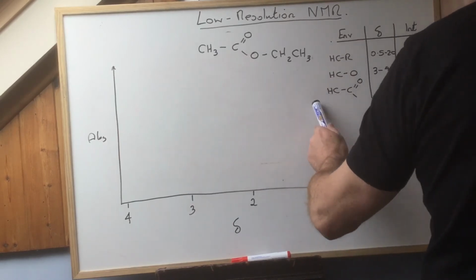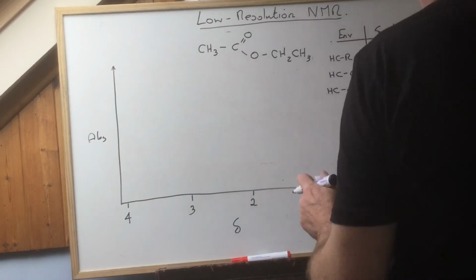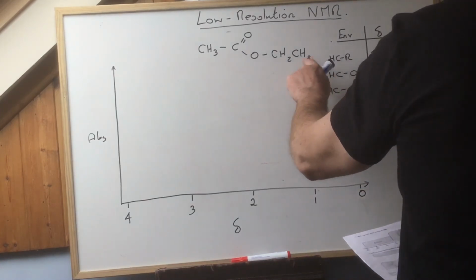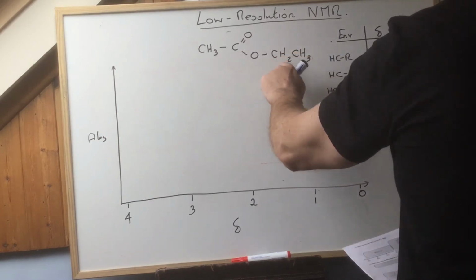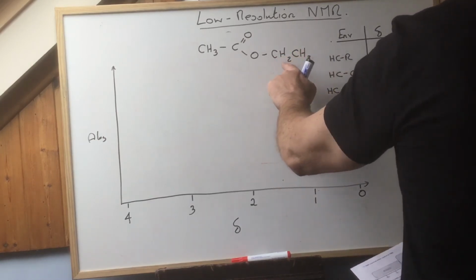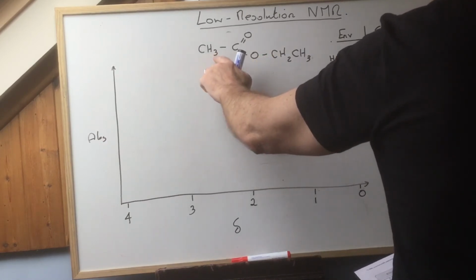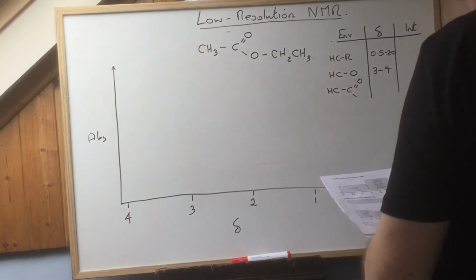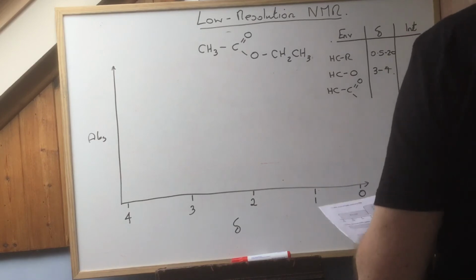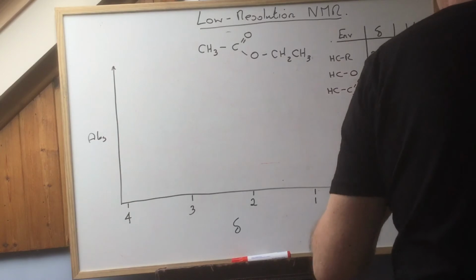Those chemical shifts, these are going to be 2 to 3. Let me just check. 0.5 to 2, a lump of hydrocarbons, well away, hydrocarbon sort of thing going on here. Those 2 there are joined to a carbon, joined to a single bond oxygen, 3 to 4. These 3 here are joined to a carbon which is joined to a carbon double bond O, which is between 2 to 3.